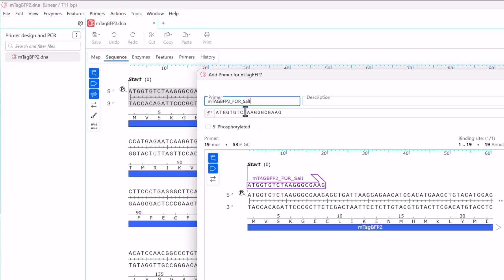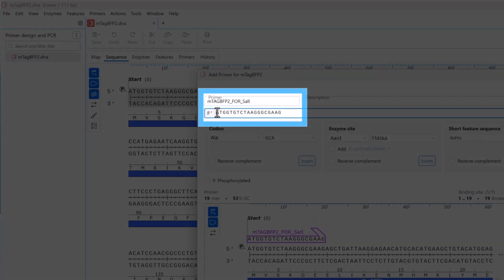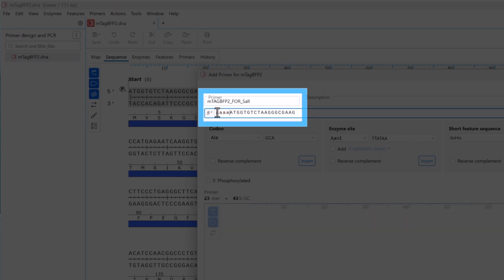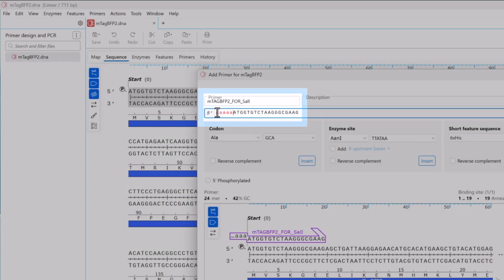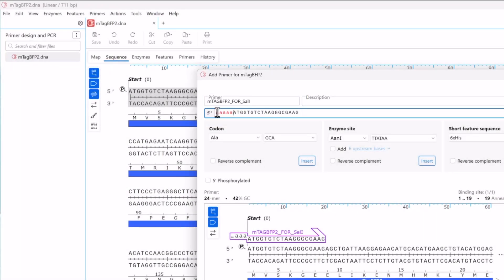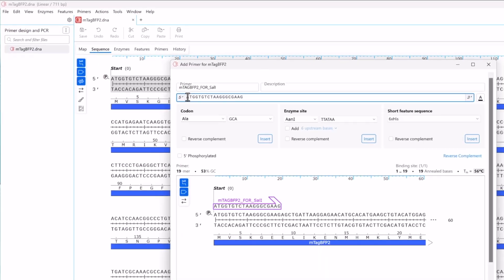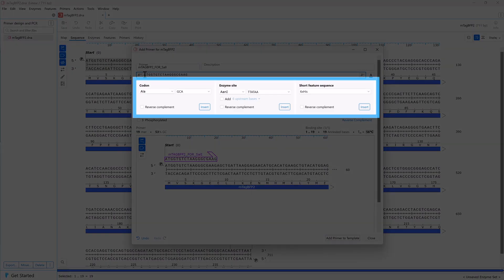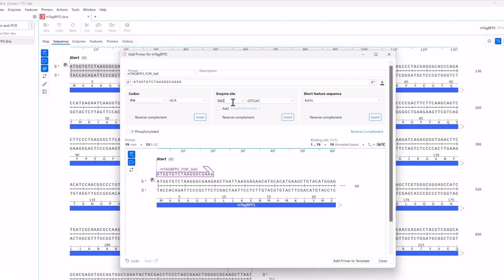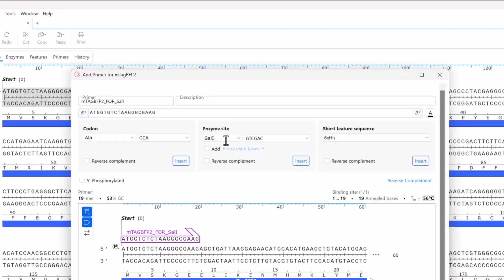Next, click at the five prime end of the new primer sequence to add an extension. SnapGene allows you to add extra sequences by simply typing a sequence, or you can use the insertion tools to add codons, restriction sites, or sequences for short features. For this example, you want to add a Sal1 restriction site to the start of the primer.